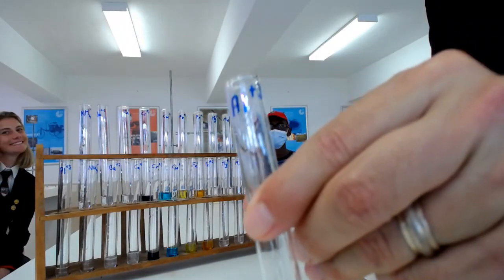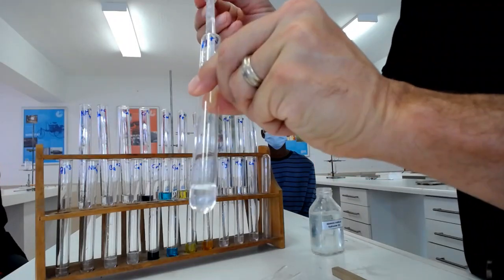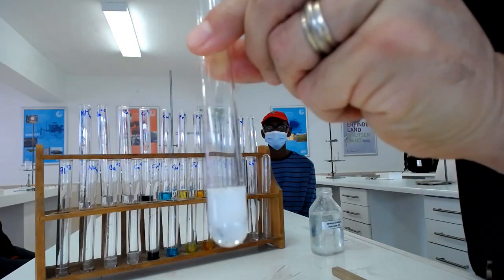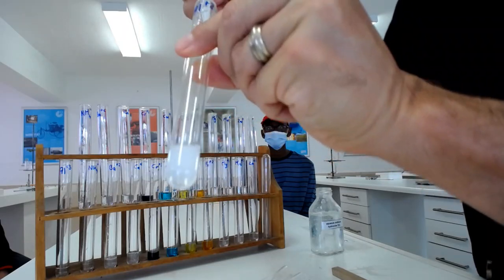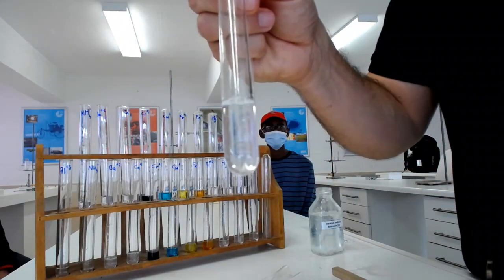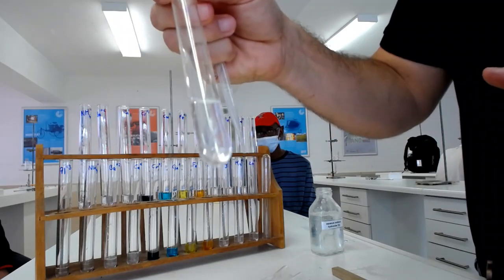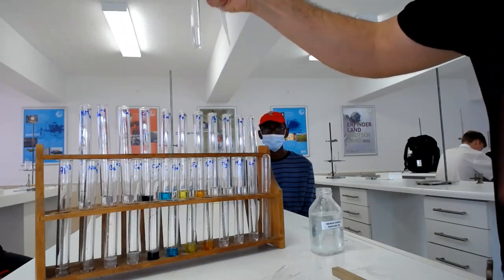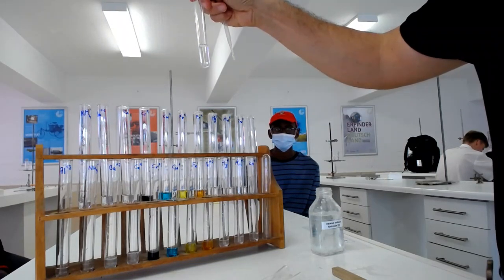You can see that's aluminium, and we're adding a few drops of sodium hydroxide, and it gives me a white precipitate. What happens if I add an excess? Excess means adding more. Immediately when you add more, it is gone. So it's as if you don't add ammonia, which precipitates it out again.